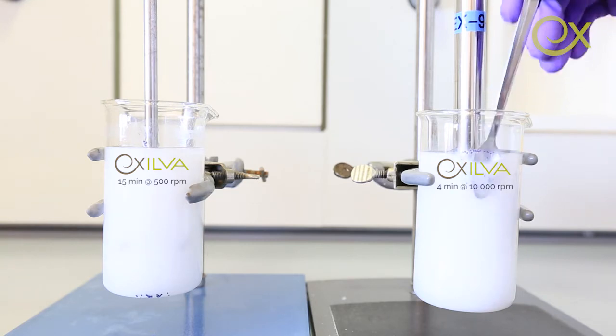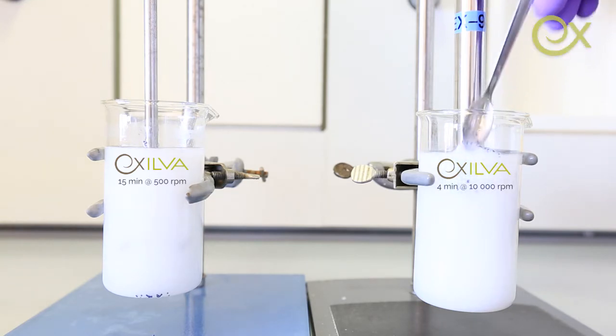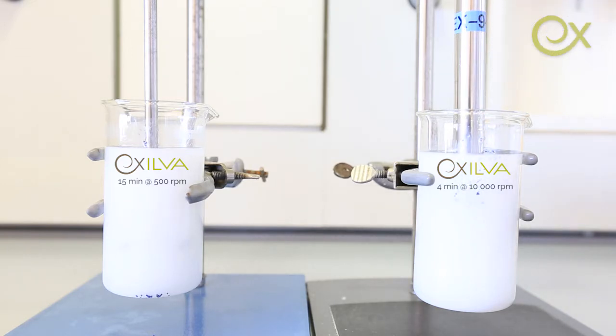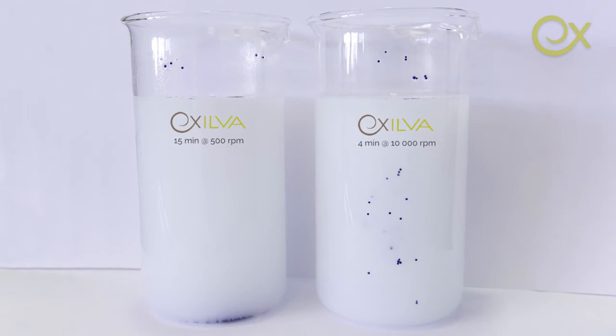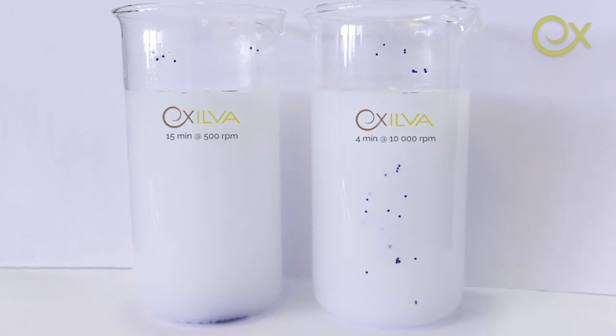However, by increasing the stirring speed or using a more powerful mixer, you will be able to achieve the same performance as shown on the right. And remember, you will not compromise the functionality of Exilva by over-mixing.